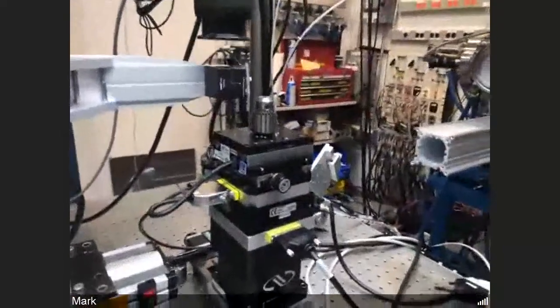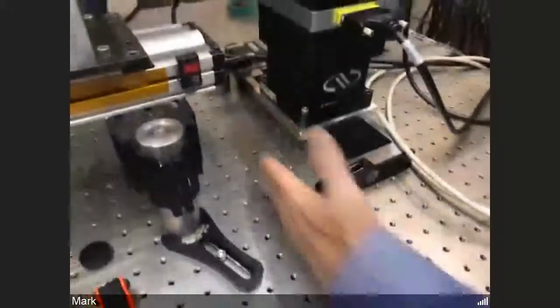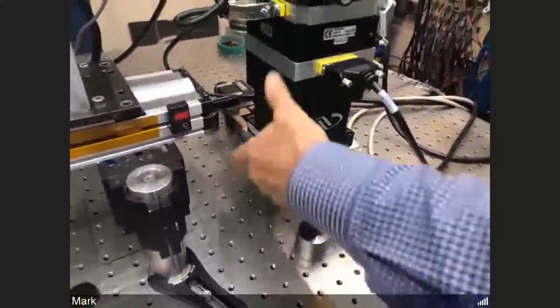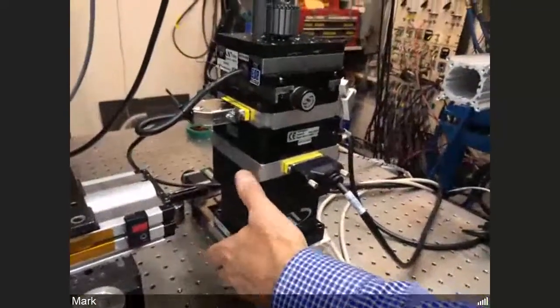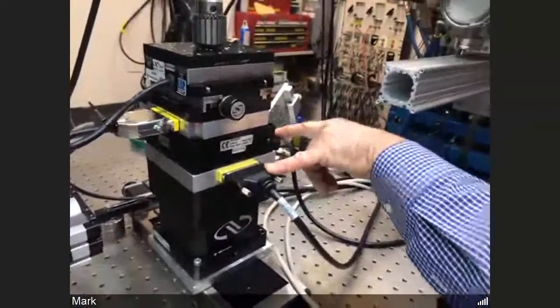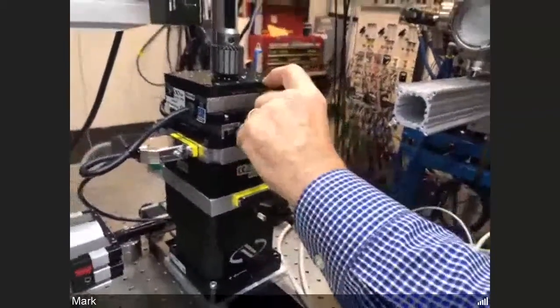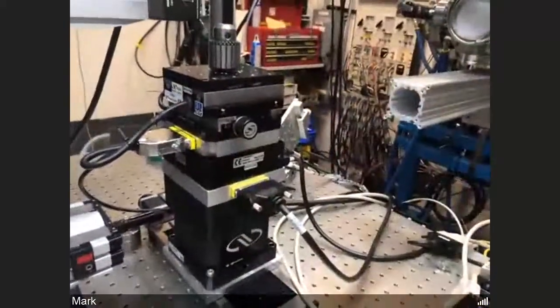So this is the sample stage that you saw previously: a horizontal stage to move the sample in and out of the beam, and a vertical translation stage. This has 30 millimeters of travel. What we've got here are some slip rings so that the stages above the rotation stage don't need to have their cables dragging around as we rotate.